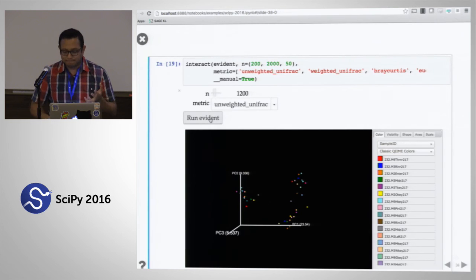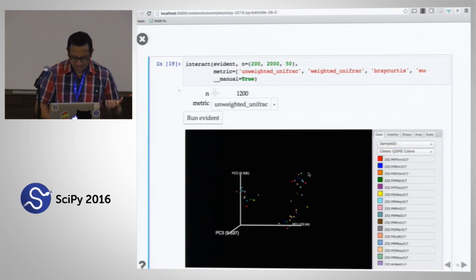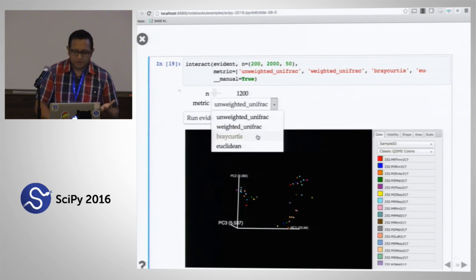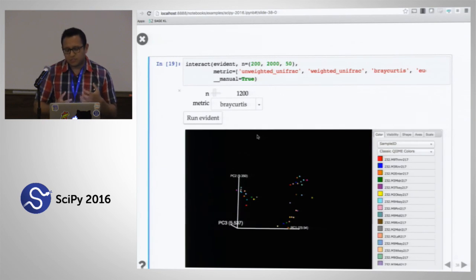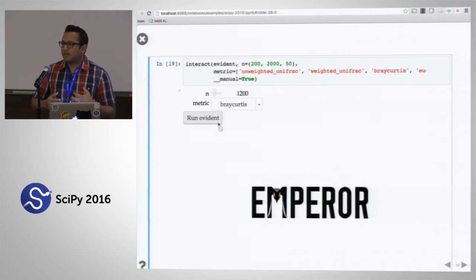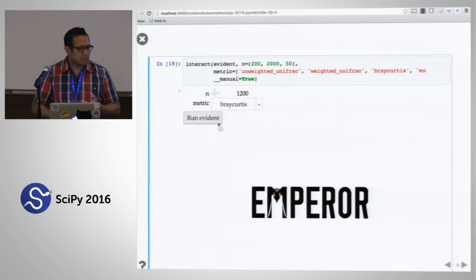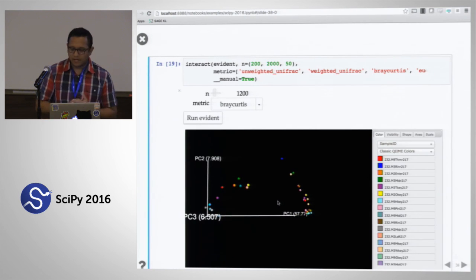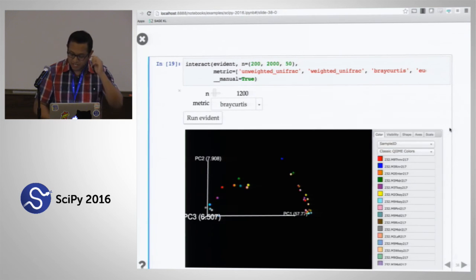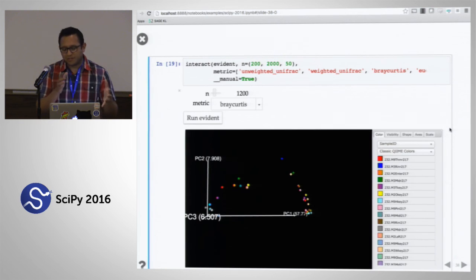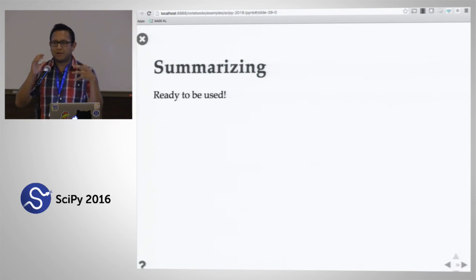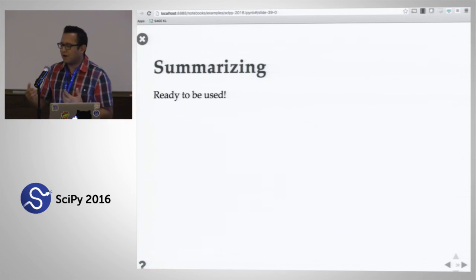We select 1,200 features per sample and the unweighted UniFrac metric and run it. Because we're using scikit-learn's pairwise distances, these computations are distributed onto eight cores, and as soon as they're done they're sent back, loaded into the Emperor object, and presented on screen. This took us probably 50 lines of code, and it works really nicely. I can compare this to a different distance metric and start interrogating the biological effects in this dataset. It's all interactive, all live, and it really didn't take much time.